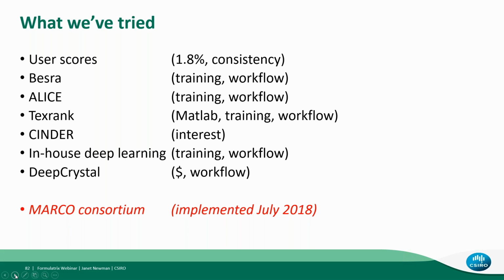So what we did is we developed an app. We call it Cinder, for Crystallographic Tinder. The idea of that app is that it will just present images to anybody who cares to open this app, and you can score them, and we would get images for a training set for machine learning. And then we would use all the information that we had, user scores, Cinder scores, anything that we could get, and we would develop our own scoring algorithms.